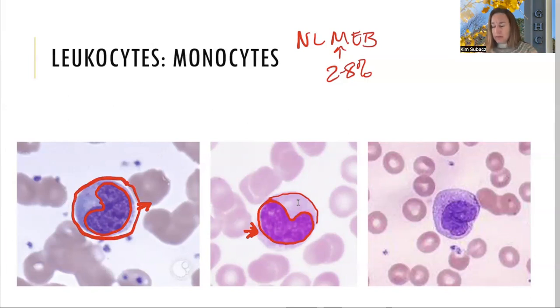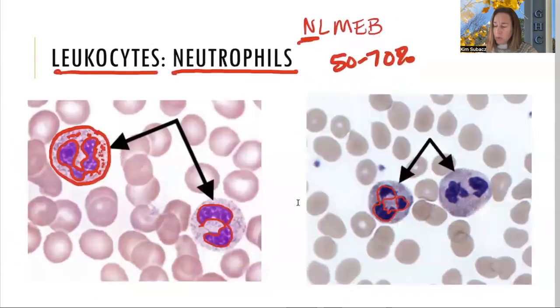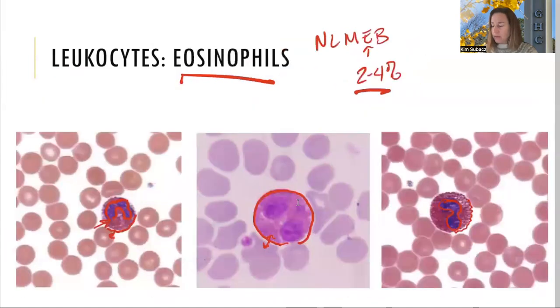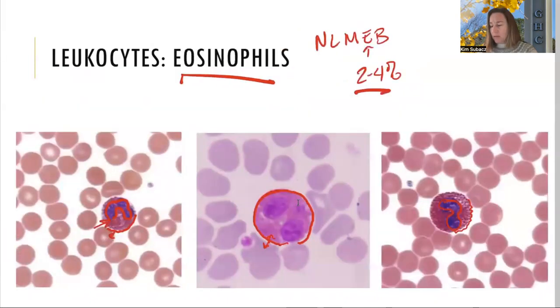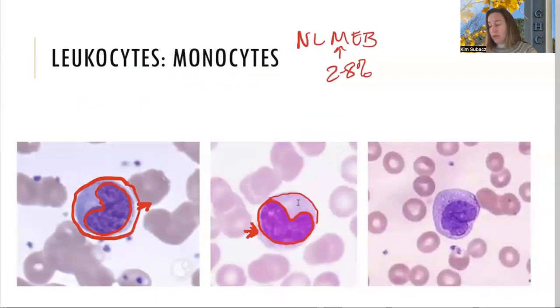Don't confuse monocytes with neutrophils. Monocytes are big with a massive indented kidney bean-shaped nucleus. Neutrophils have a multi-lobed nucleus. Monocytes are also bigger than neutrophils — neutrophils are bigger than red blood cells, but monocytes are bigger still. That's monocytes — and I hope this helps, have a great day!